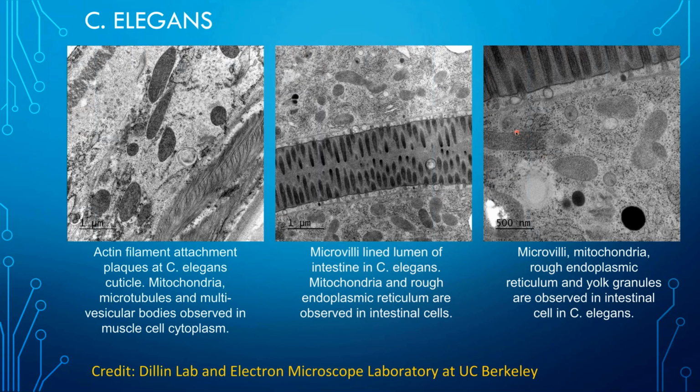And then on the right, you can see there's some mitochondrial structure here and here, and again, a hole in the section. So C. elegans can be difficult to infiltrate as well. But nonetheless, you don't compromise the intensities of the features that you're interested in just because you've got some parts of the image that are really skewed in their intensity.